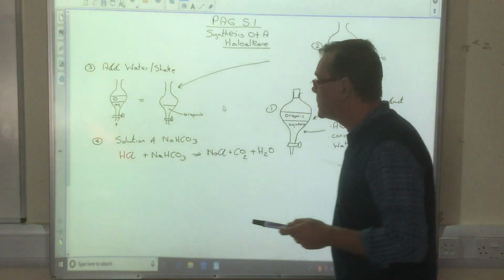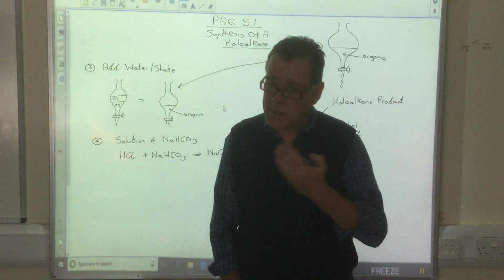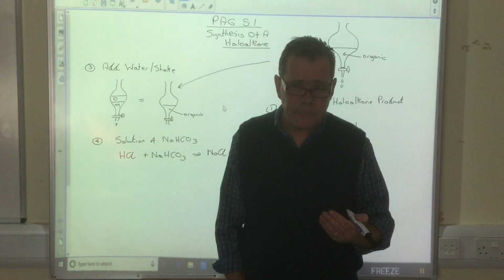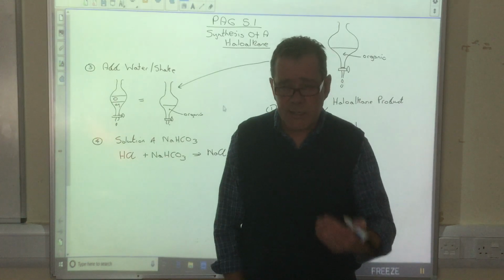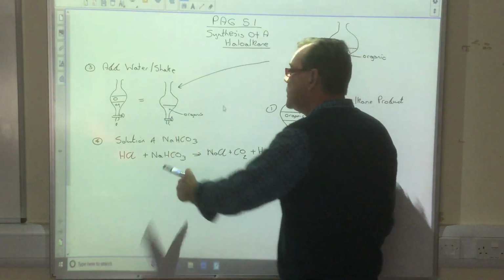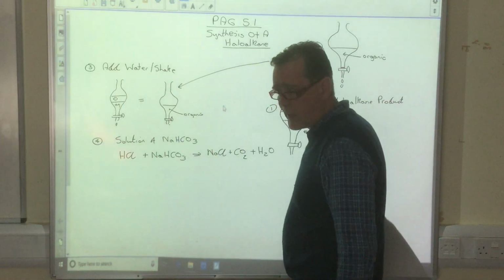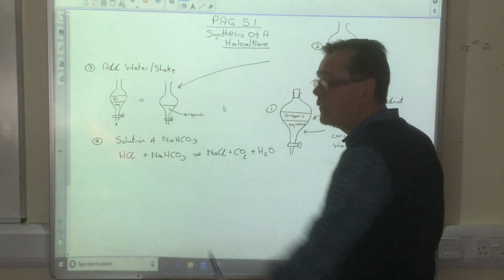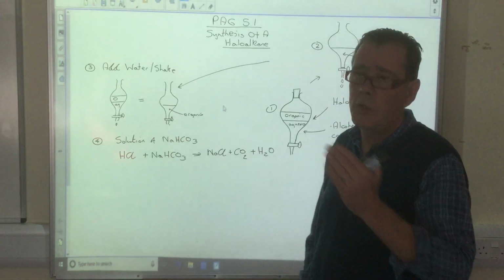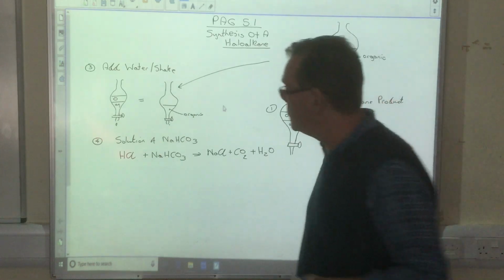Separates that, and you can wash it by adding more water, and you can neutralise excess acid by adding sodium hydrogen carbonate solution, again into your separating funnel, a bit more water, you get fizzy, but it cleans the organic layer. That is how a separating funnel works, wherever you've got a mixture of water-soluble and oil-based components in your reaction mixture.